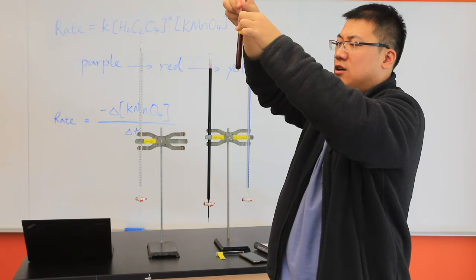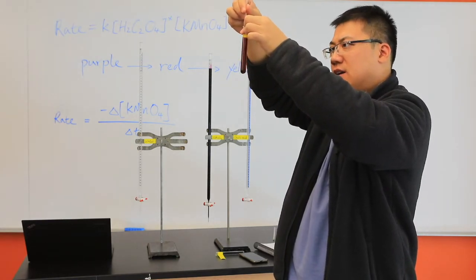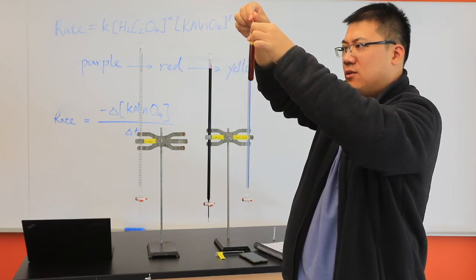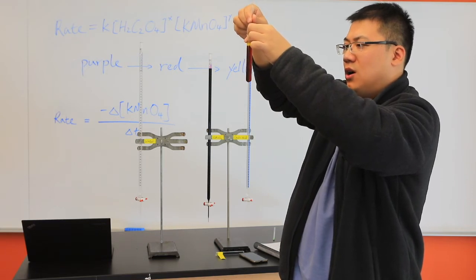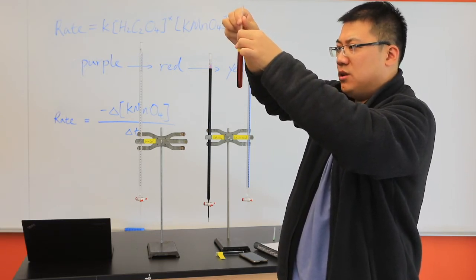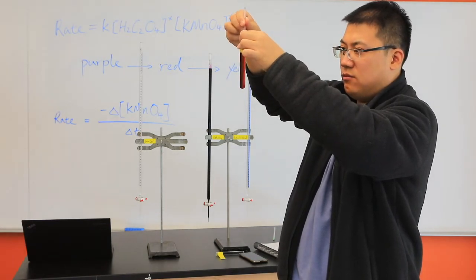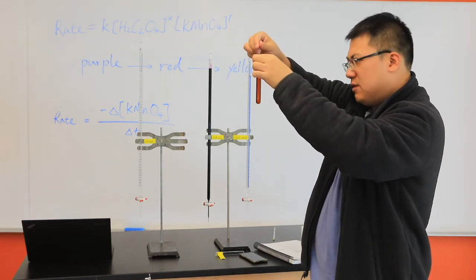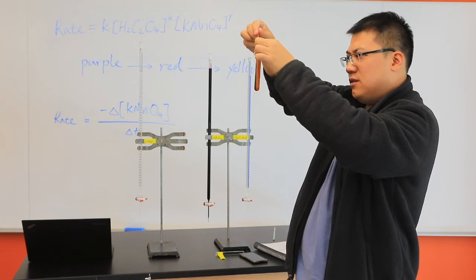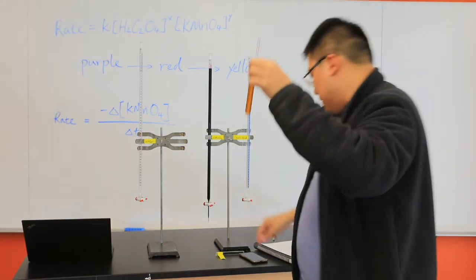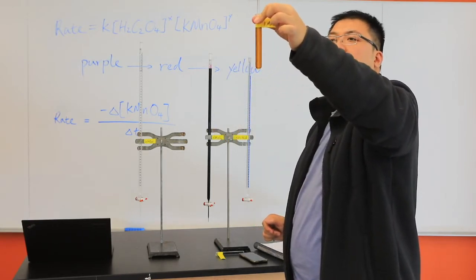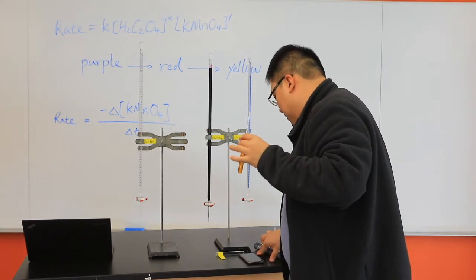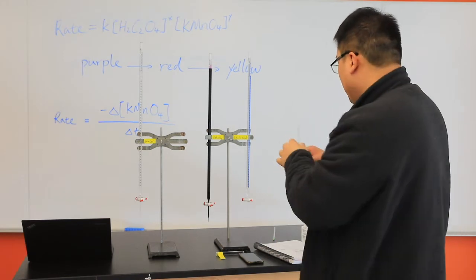Oh, I'm a little tired. Oh, there's more color change here. This is the red. We're going to let go until all of your reactants are consumed, so it will turn to yellow. We're getting there. Alright, stop. So, this will be considered the end of the reaction. It is 2 minutes and 54 seconds. I'm going to set this aside.